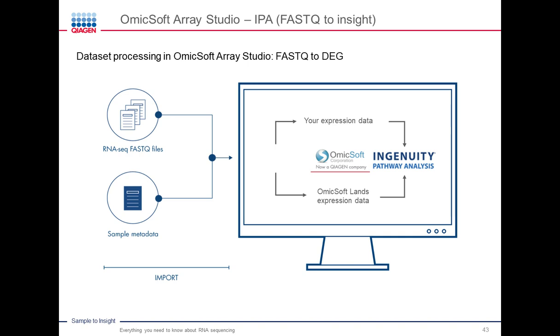We also have the OmicSoft Array Studio, and basically you can go from FastQ to Insight. And data processing is performed in the OmicSoft Array Studio, and you can move from FastQ to your differential gene expression analysis.